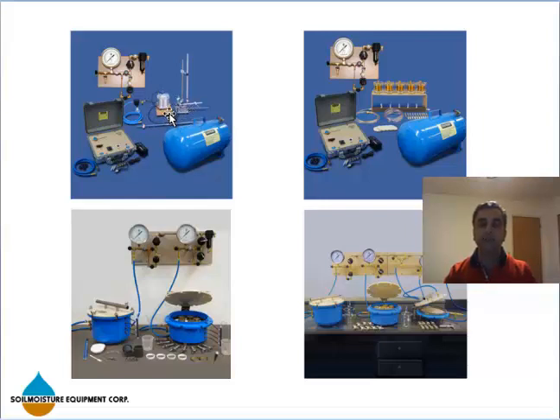I have a better picture later on in my next slides, but basically you have a pressure source, a pressure tank, an air tank that can be used for pressure and vacuum, and a pressure cell, and of course a pressure regulating system or a pressure manifold that goes from 0 to 5 bar.